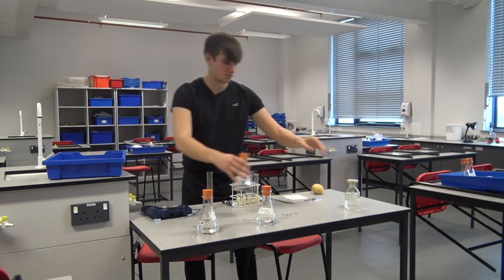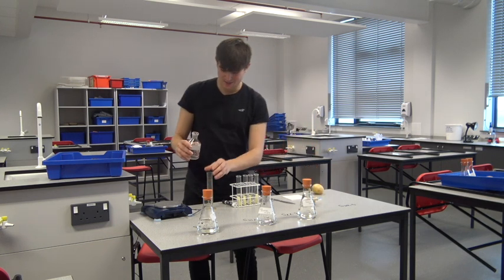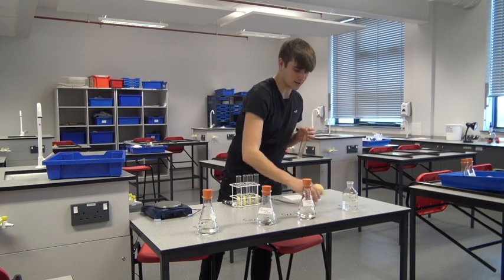The last one is just pure distilled water. What we should see with this one is that the mass of the potato chip actually increases, as water moves into the chip through osmosis.